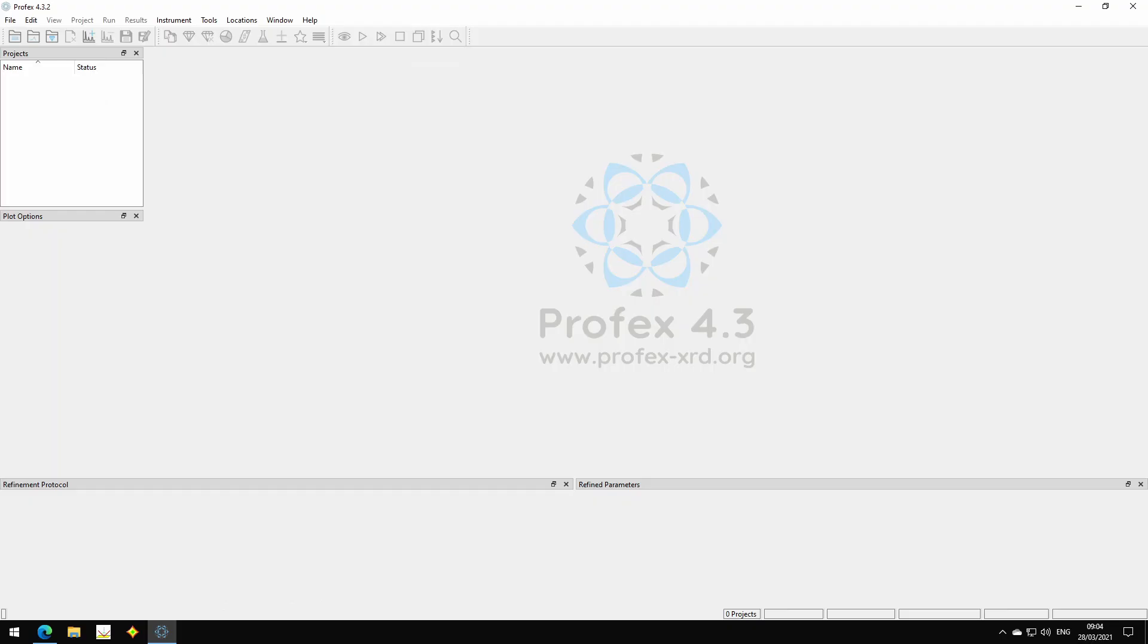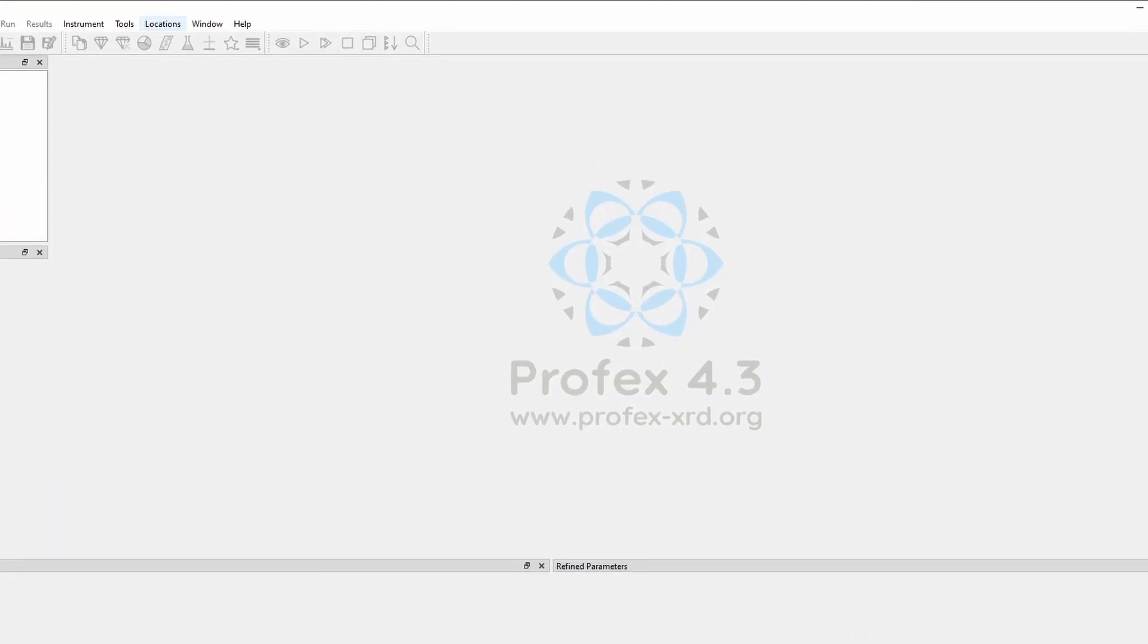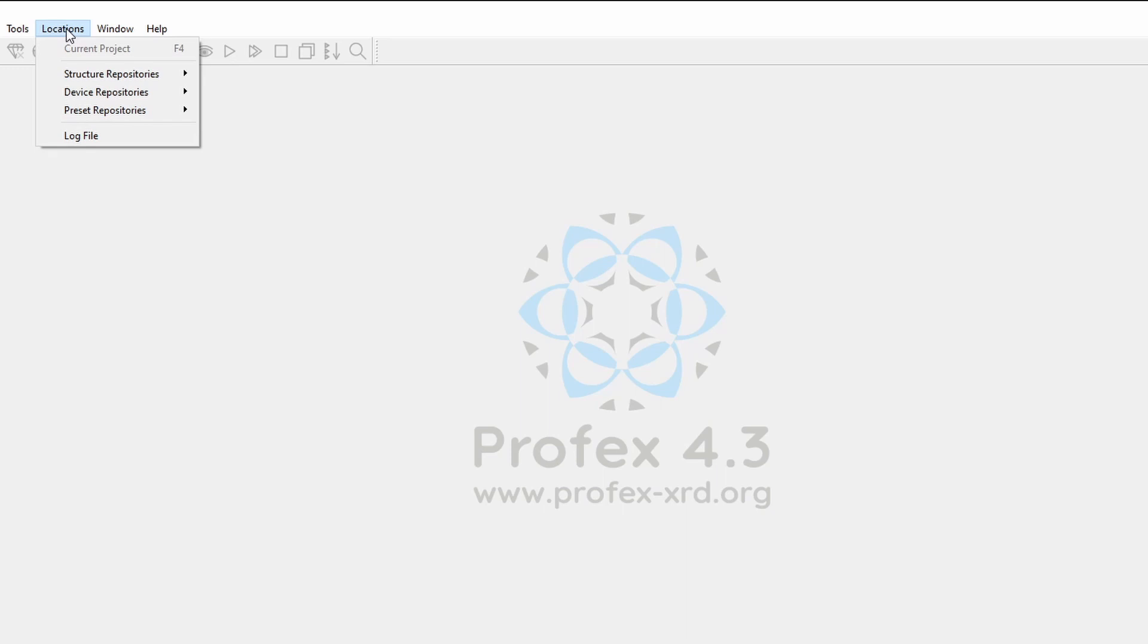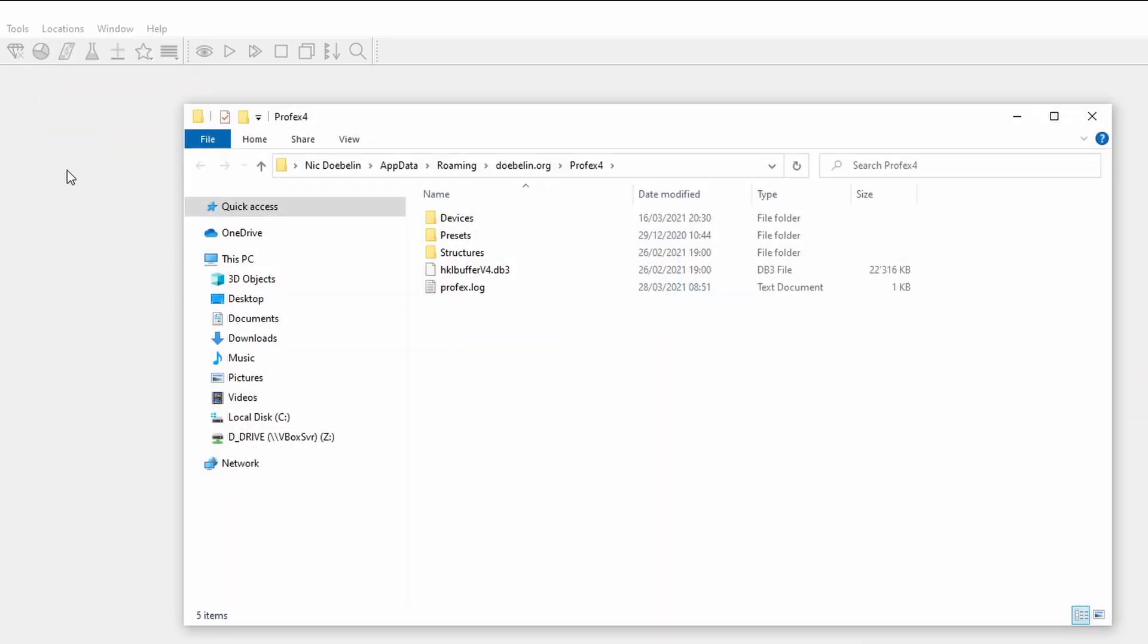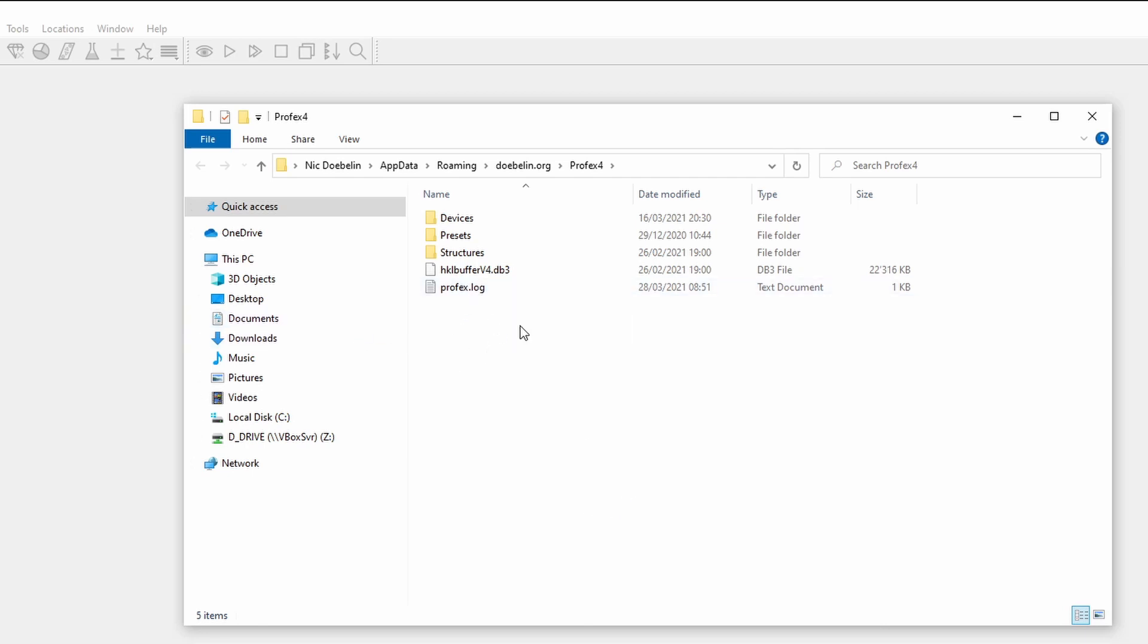Another small new feature is found in the Locations menu. There is a new entry log file. When you click it, it opens the Explorer at the location where the Profex log file is stored. So when you need access to the log file, for example, when you ask me for support, because you found a problem, I usually ask you to send me the log file. This is the easiest way to find it and to attach it to an email.